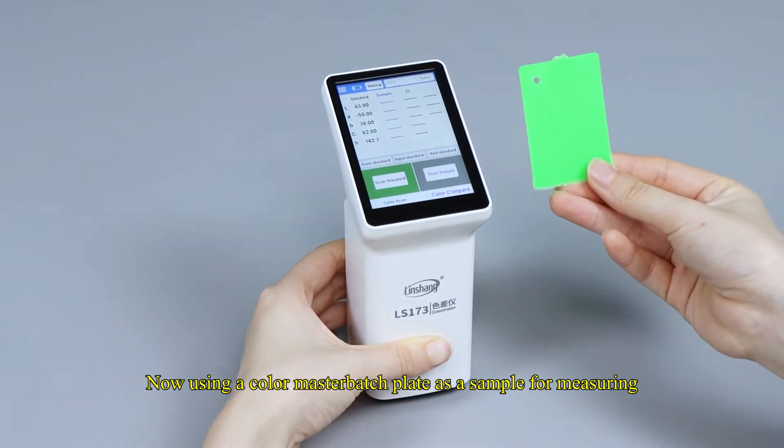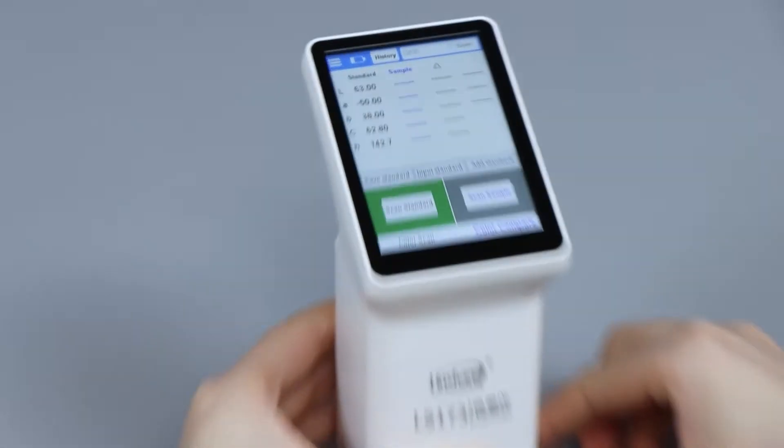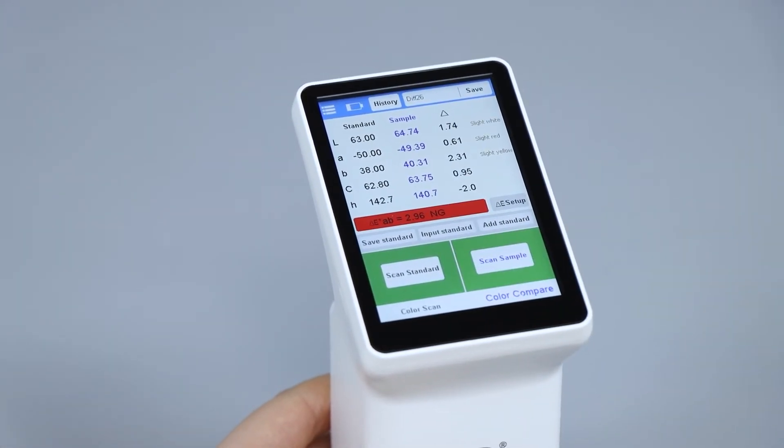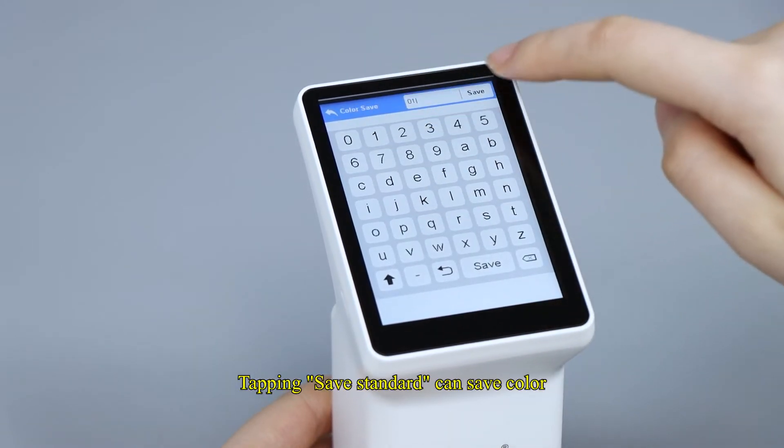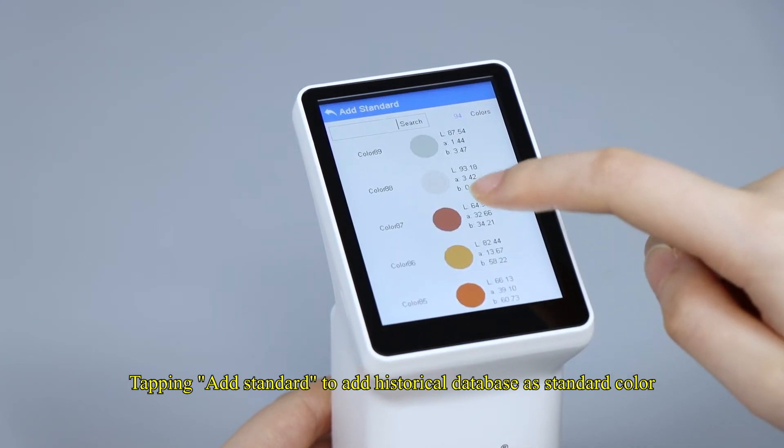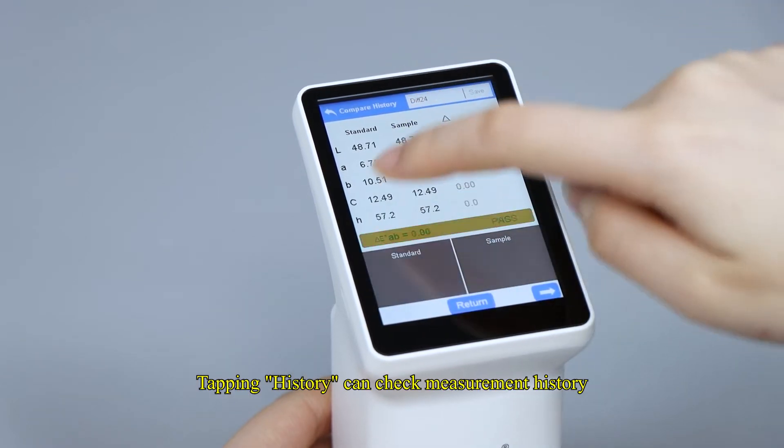Now using a color master batch plate as a sample for measuring. Tapping save standard can save color. Tapping add standard to add historical database as standard color. Tapping history can check measurement history.